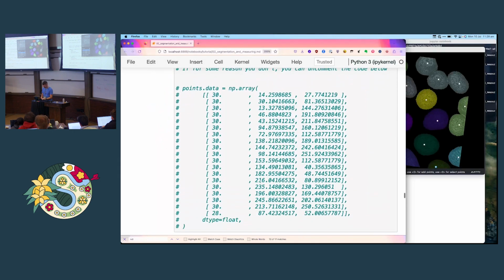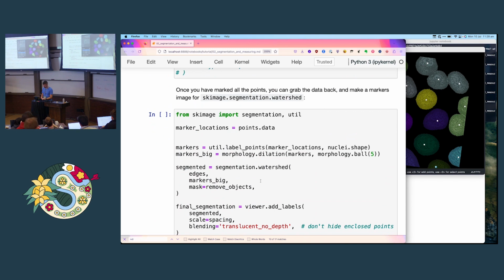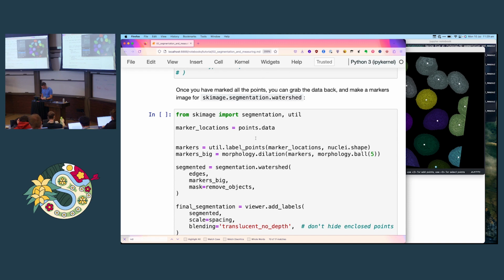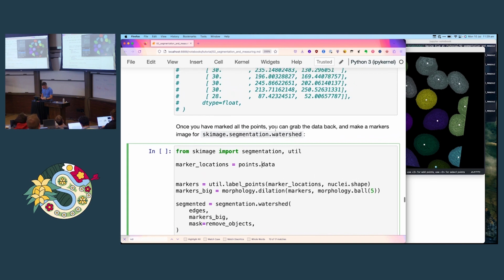So what we want to do is separate those two manually, and you can, in 3D, apply the eraser. And I'm going to make it a bit smaller so I don't obliterate the whole thing. And now I'm like milling. This is very Minecrafty. So I'm just milling into it. So you can see now the objects are separate.